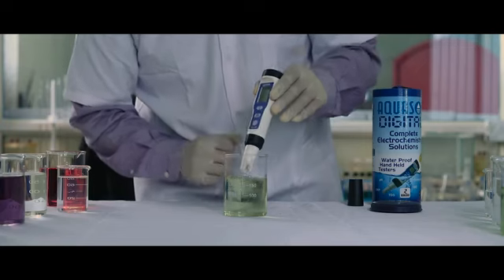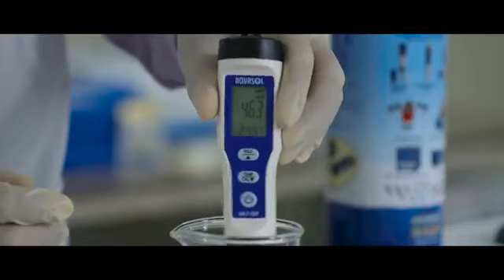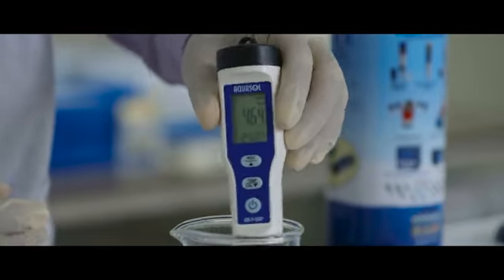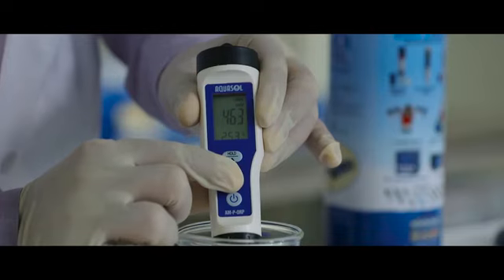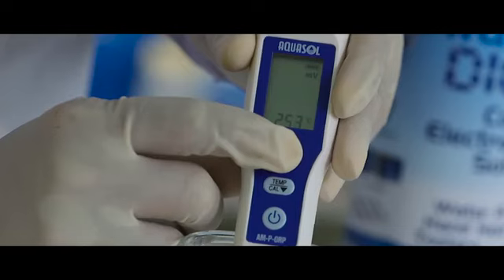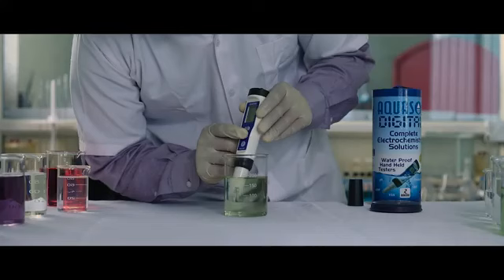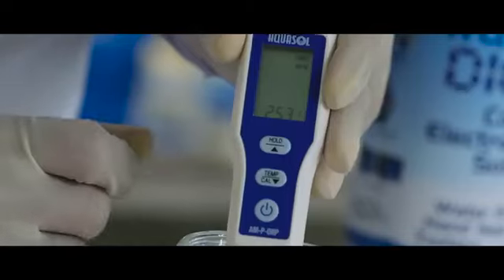Calibration. Dip the electrode in the 475 standard buffer solution. Stir gently for a stable reading. Press and hold the CAL key to start calibration. Use the up and down arrow keys to adjust the reading. The meter will start flashing once the calibration is done.